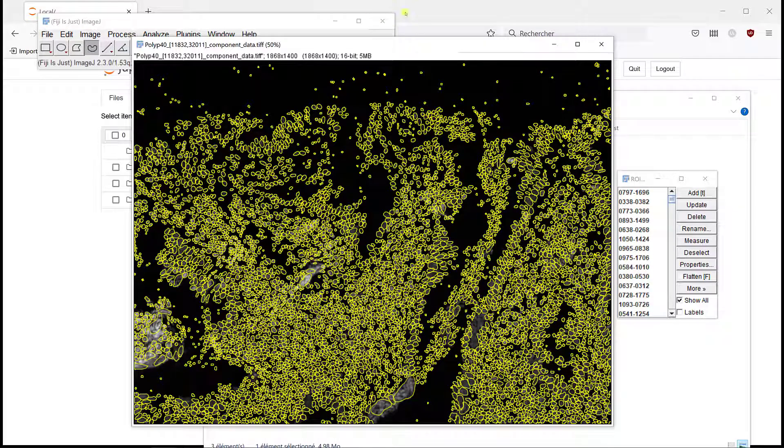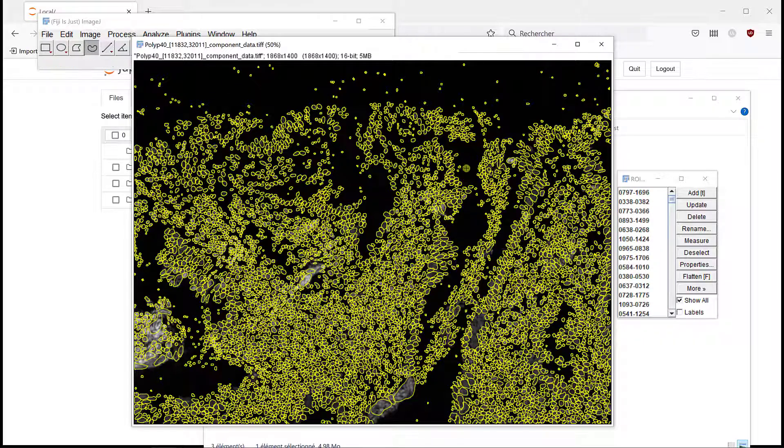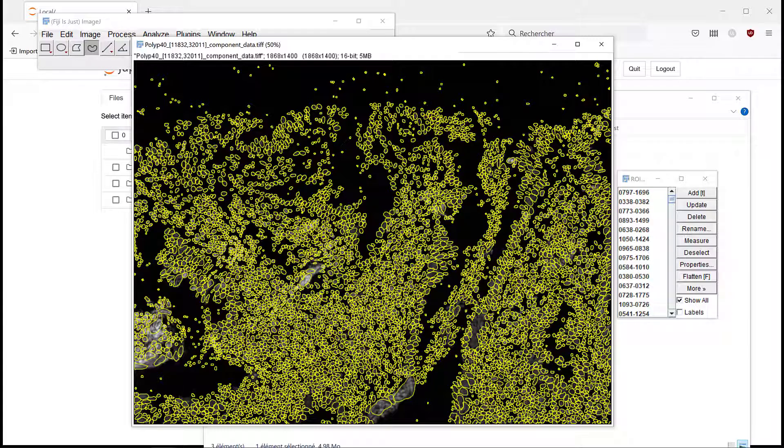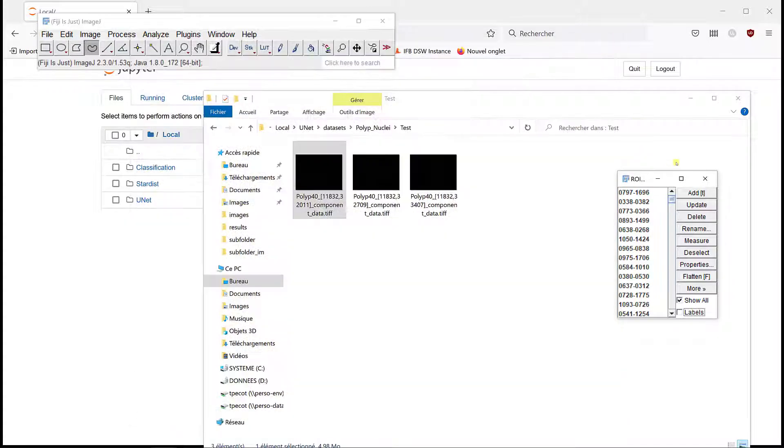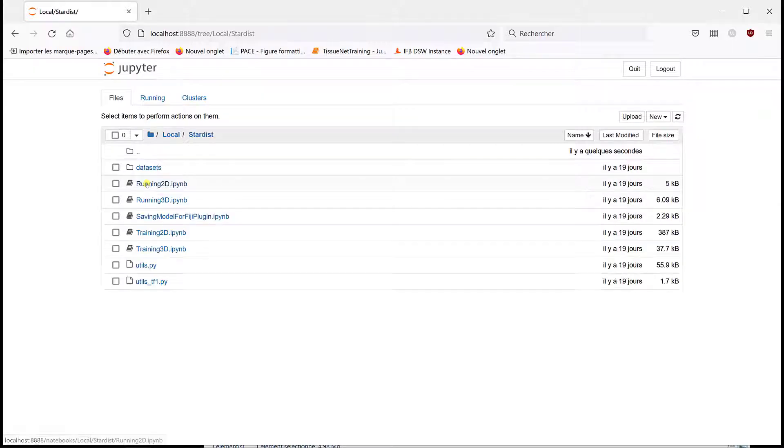So maybe we can try to retrain Stardist model to get better results. That's what we're going to try to achieve. We'll see if we can improve that. I'm going to close this, I'm going to go back to my Jupyter notebook, I'm going to open Stardist, and we're going to do training in 2D.